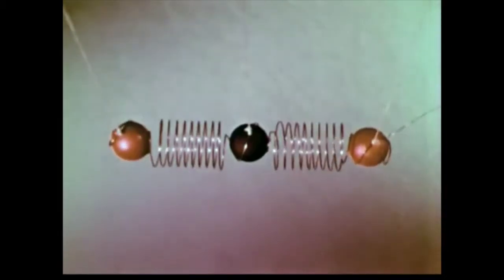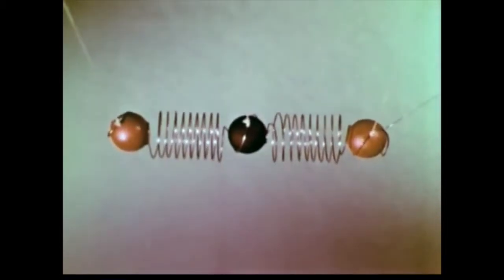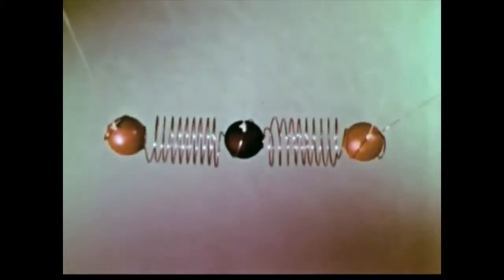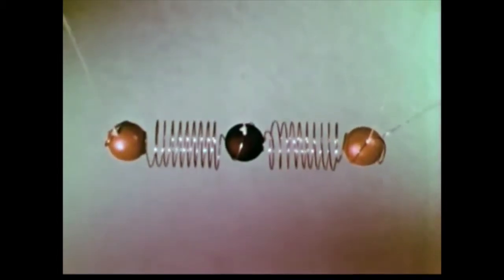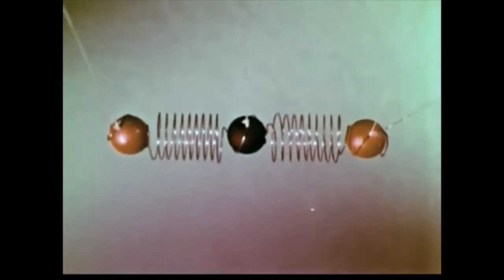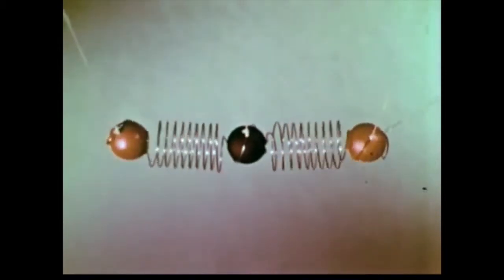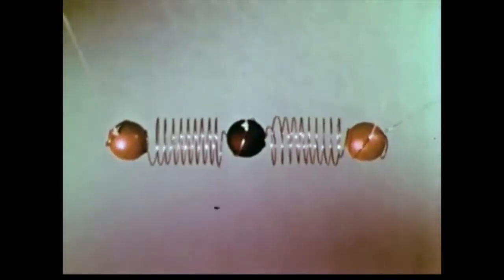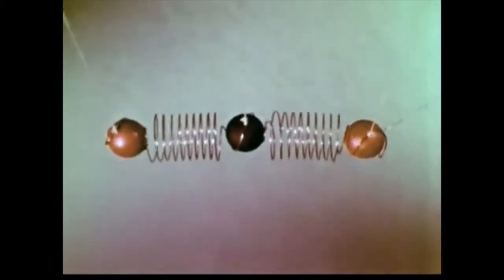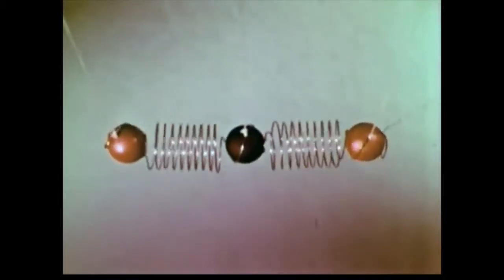As we attempt to excite vibration very slowly at first, you can see how the molecule flops around rather loosely, but doesn't really fall into any organized, repeating pattern of vibration. When we slowly increase the frequency, we reach a point where the vibration of the molecule falls into a nice characteristic pattern called a normal mode. The molecule has reached one of its natural frequencies of vibration.